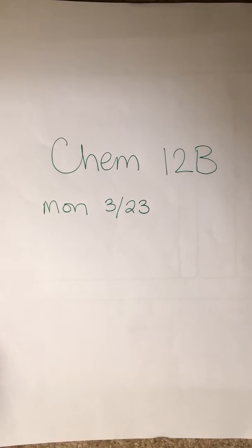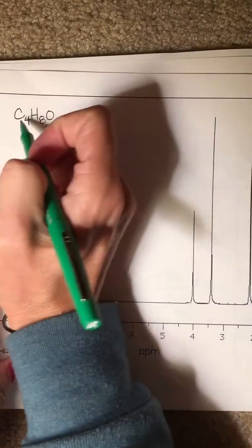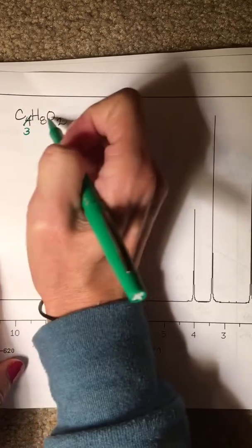All right, guys, this is our third video on Monday, March 23rd. And we're going to start by analyzing this spectrum right here, especially since I've got a typo. So let's fix it right away. So this should be C3H6O2.